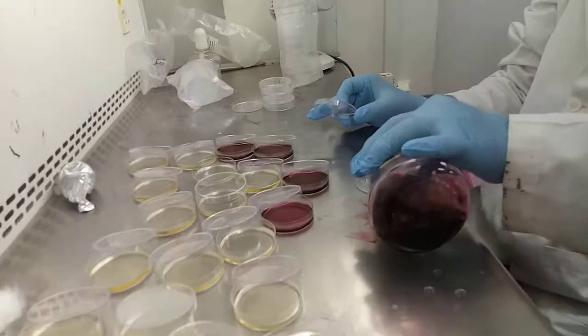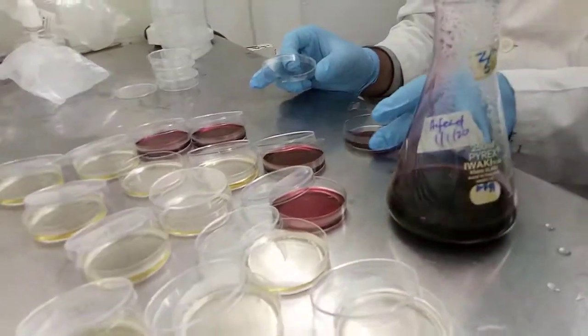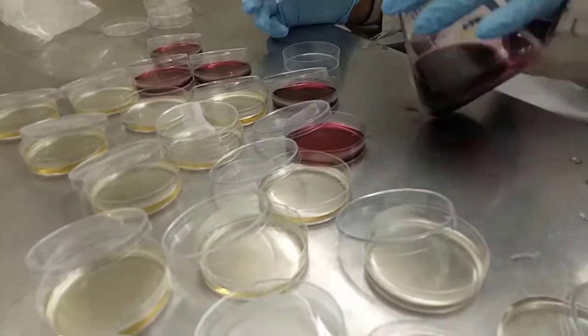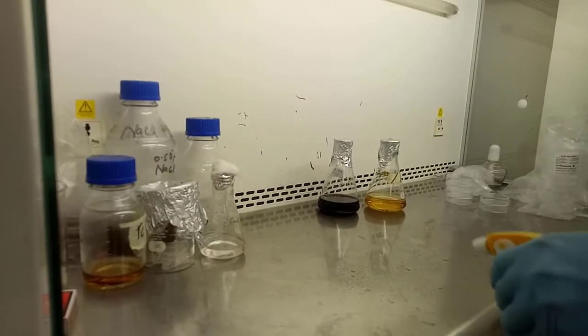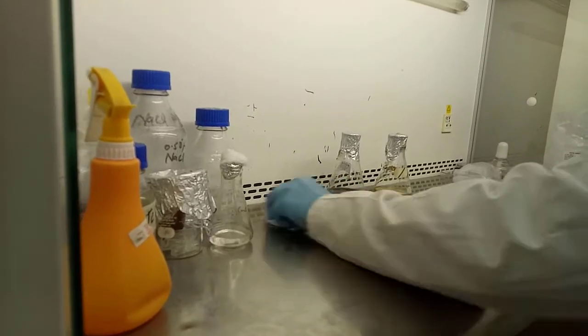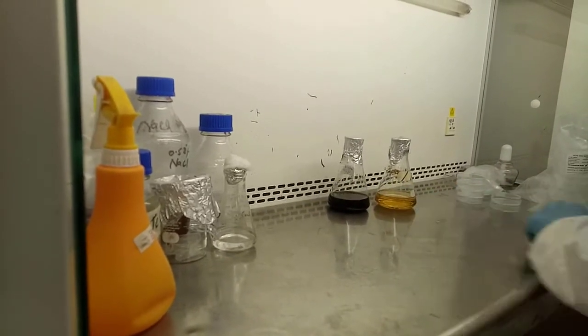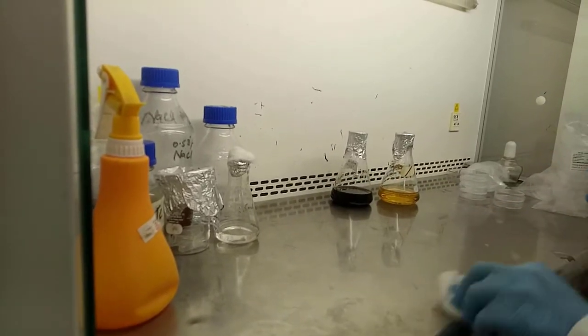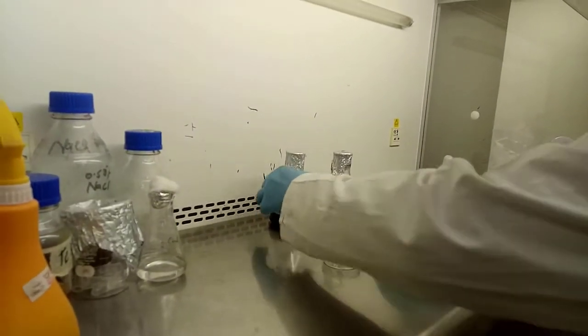Today we will see how to pour agar media into petri plates for bacterial culture. Let's start. We need to clean the laminar hood surface area with 70% ethanol to prevent any contamination on the surface area.